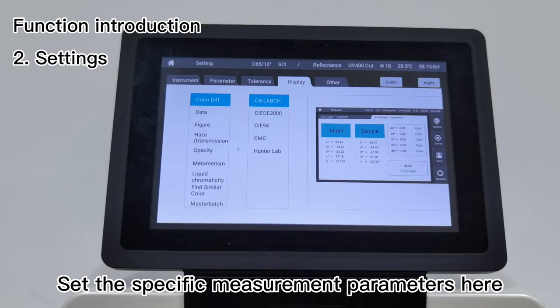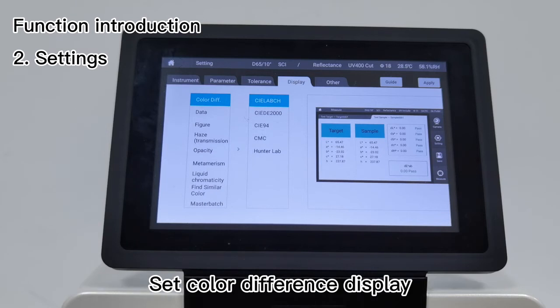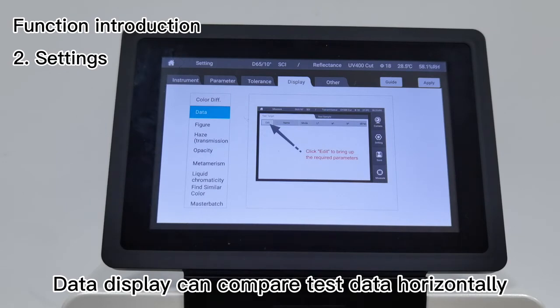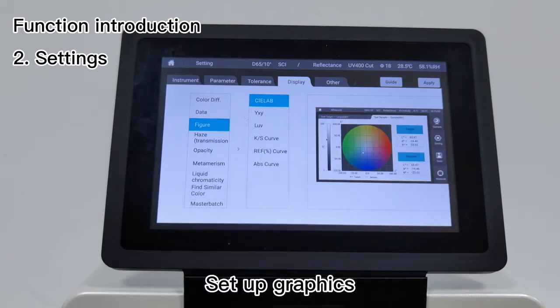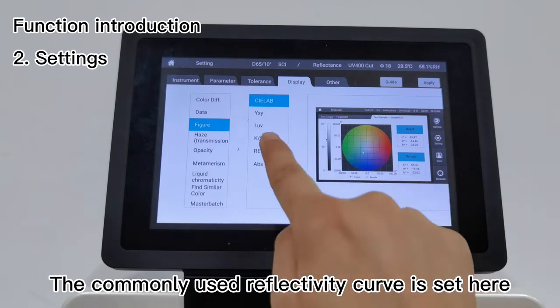Display settings allow you to set the specific measurement parameters here. Set color difference display data, display and compare test data horizontally, and set up graphics.